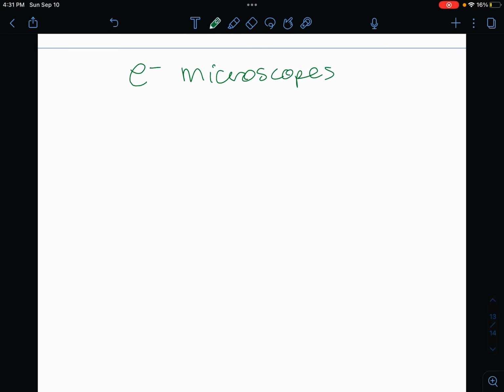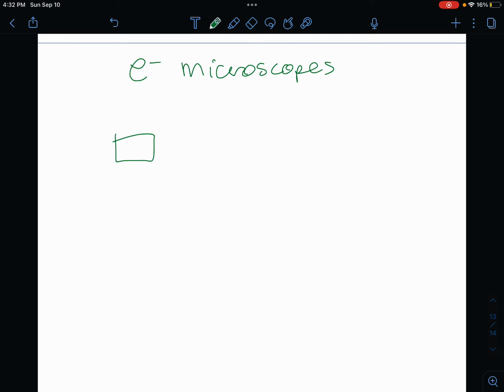In this video we're going to be going over another type of powerful microscope for the class I'm taking from the notes. So, we are going to be talking about the extremely powerful electron microscope, and it's very similar to light microscopy. Last time we had that little artist rendition of a light microscope, which looks something like this.